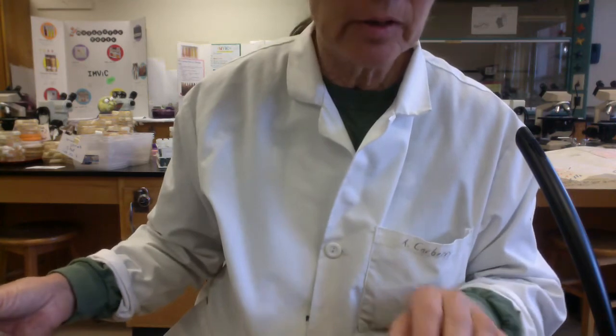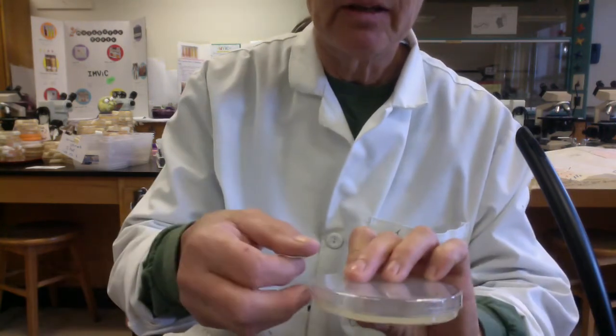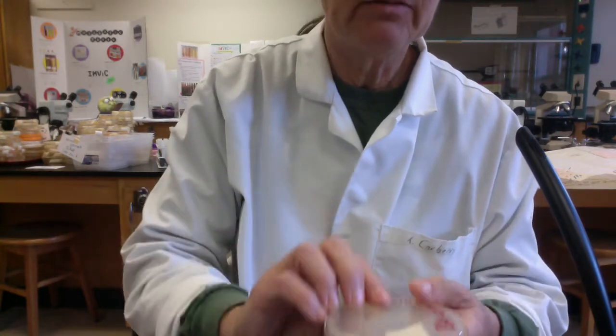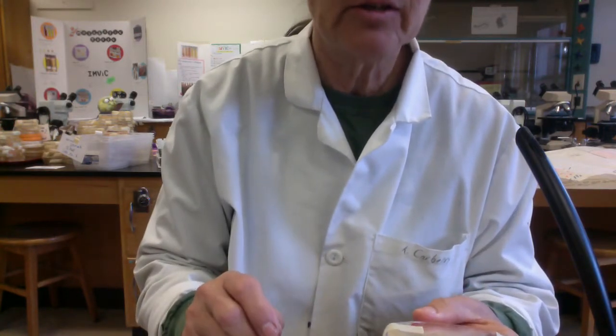And then, as we always do, folks, we're going to tape the lid to the bottom, right? And we're going to invert the plates, and we're going to incubate at 30 degrees Celsius.